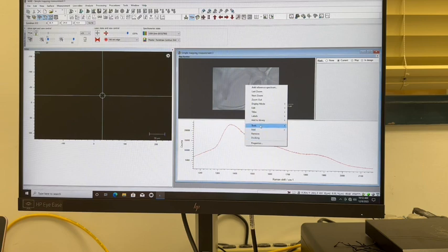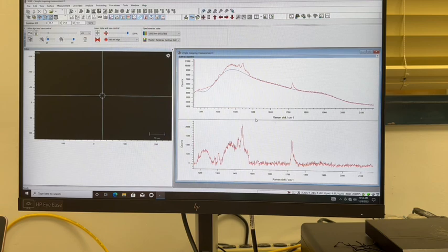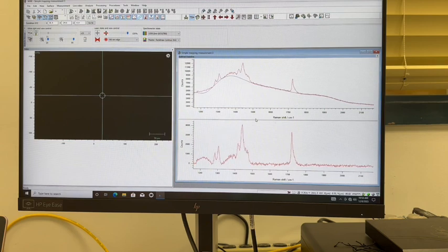Now that the mapping data has been saved, we will continue to perform the analysis on the entire data set. We will first subtract baseline, which using page up and page down, you can see how this baseline subtraction will affect each data file. Once we have established that the baseline subtraction looks good, you can go ahead and accept for all data sets.